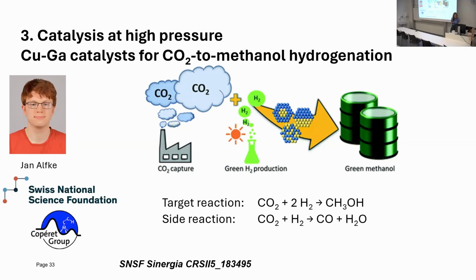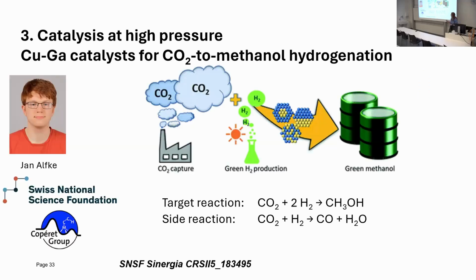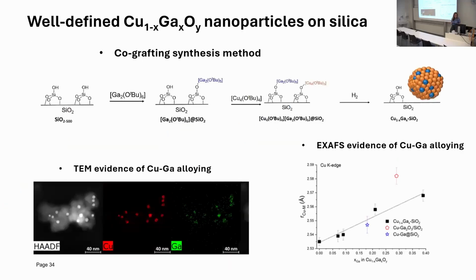In this work, done by the PhD student Jan Alfke in collaboration with the group of Christophe Copéret at ETH, they have a very nice method for synthesis of the catalyst. Well-defined materials, not really catalysts, I would say it's like a model powder catalyst.